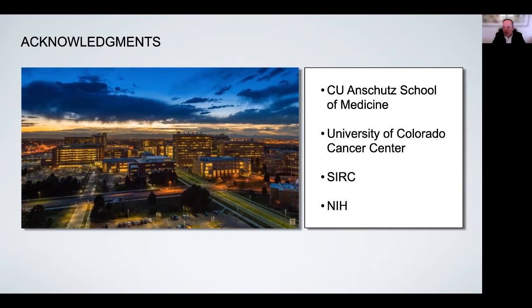Okay, yeah, this makes sense. So it means that you actually have to deal with the complex sample prep as well as a very intense computational analysis of the data afterwards. Just as you said, if you're looking for the structure which nobody knows, right?